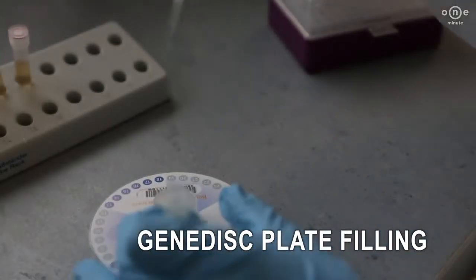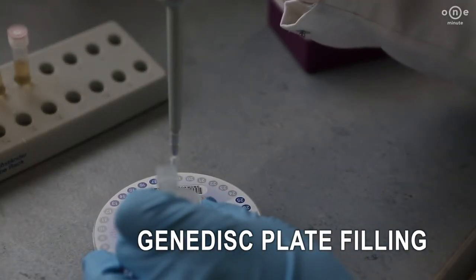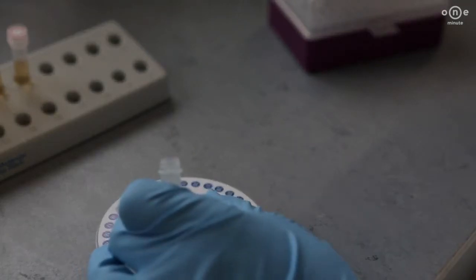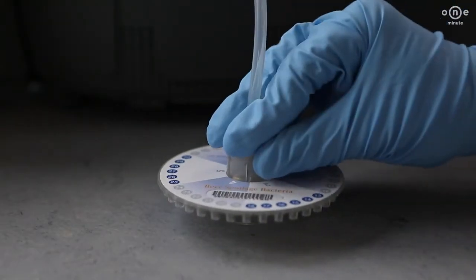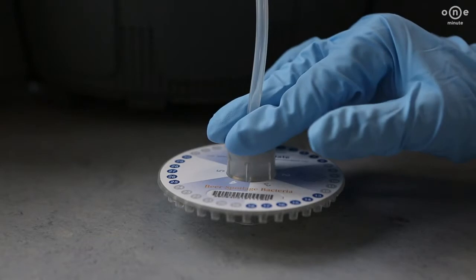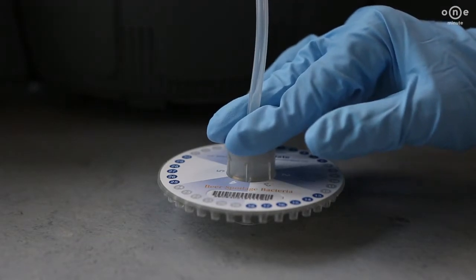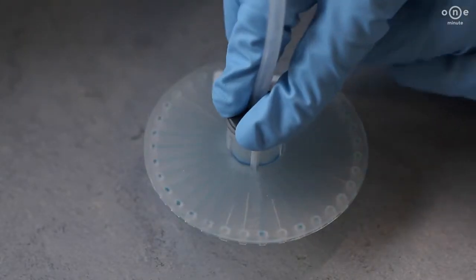While the instrument is heating, you can fill the GeneDisc plate with extracted DNA and the master mix. The sample DNA is transferred to the peripheral wells due to the vacuum step. The wells are then sealed with mineral oil to prevent evaporation.